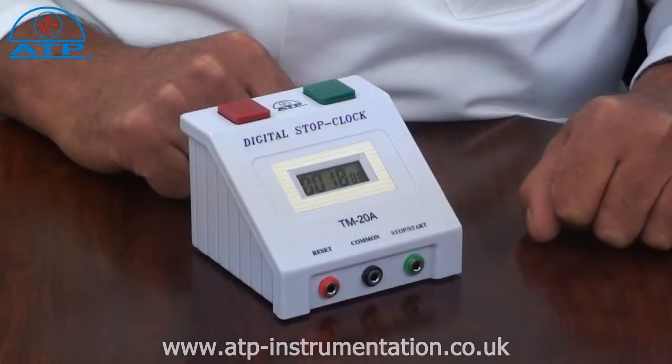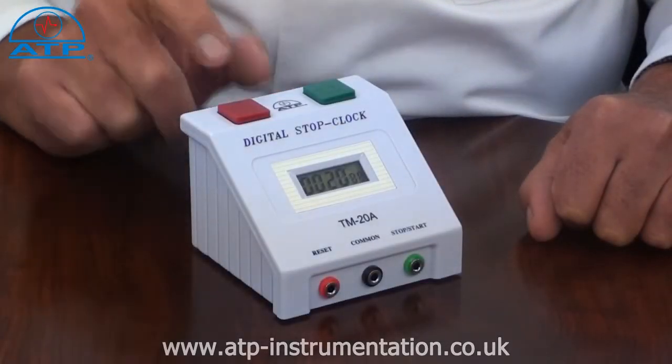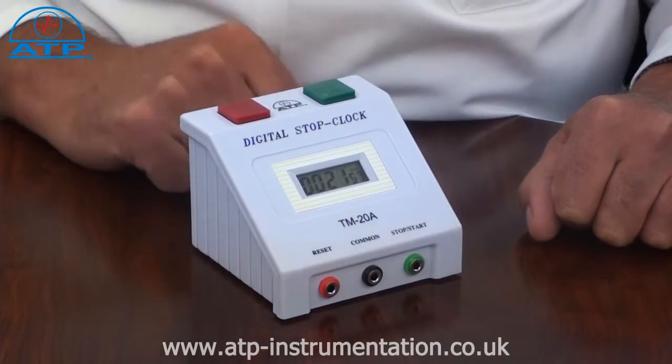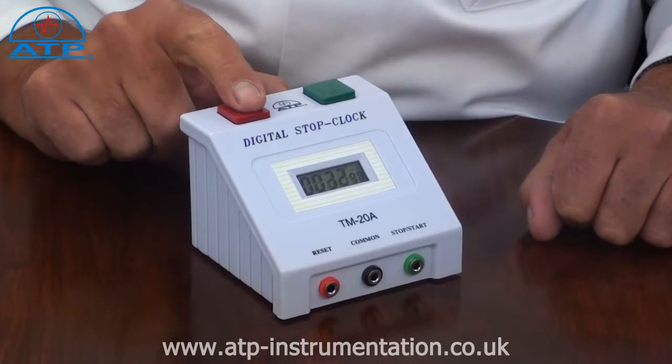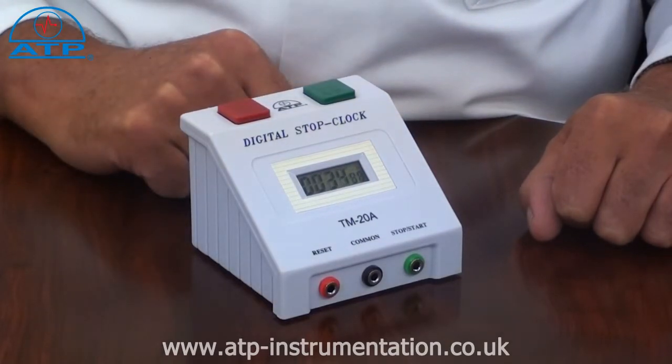When running there is a split function. By pressing the red button the display will freeze the elapsed time at that point. The stop clock however will still be counting in the background, and by pressing the red button again it will jump to the total elapsed time since started and continue to count.